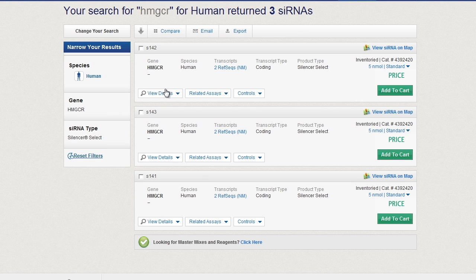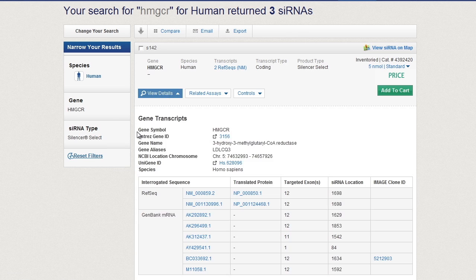To learn more about a specific siRNA, click here. Because the siRNA search tool is based on the RefSeq database, you will see details such as gene symbol, gene ID, gene name, and aliases, as well as GenBank information. You will also see associated details on the targeted exon and the siRNA location.